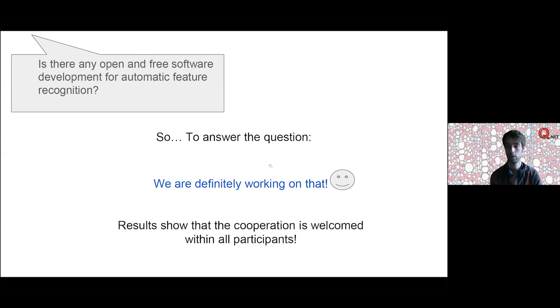This can be scanned in 10 minutes easily, but probably you're not going to see the features that you want to see. It also depends on the kind of detector that you have available, the kind of geometry that you're scanning with. So there are different geometries you can scan. For instance, if you have a 1 centimeter cube block, you could scan one half, you could scan the other half, and then you stitch together, which could double your resolution.